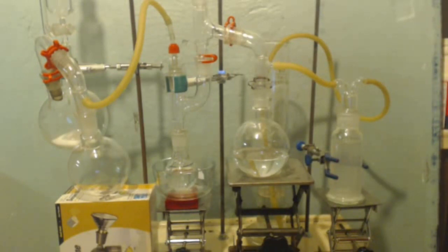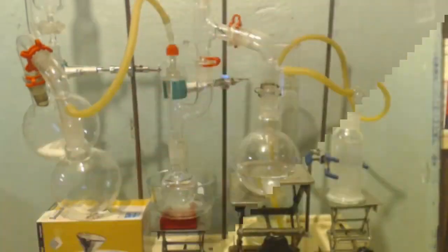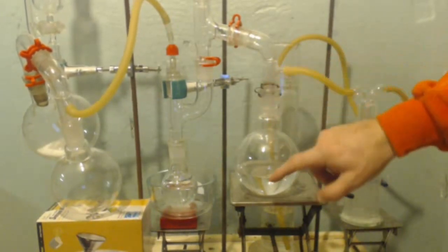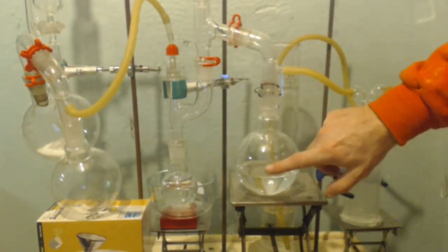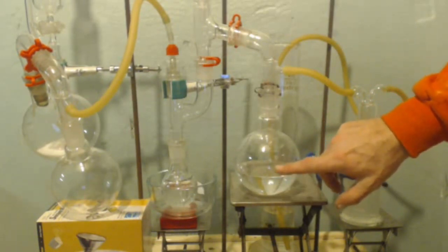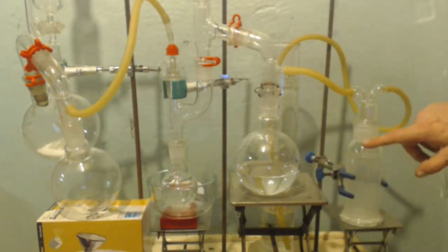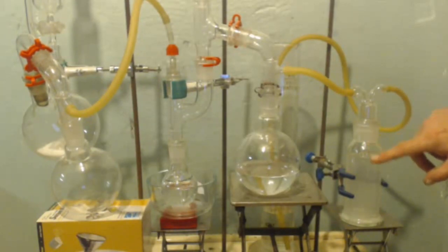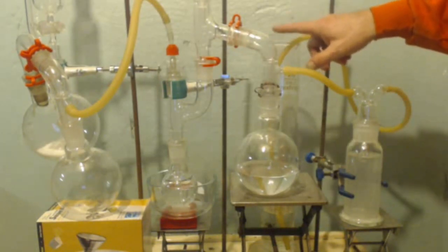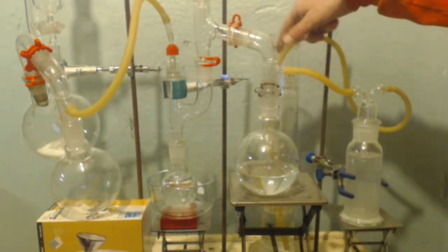So I'm going to start the reaction now. To think about it, even though there's no tube leading into this water, it will absorb some hydrogen chloride and become hydrochloric acid. Dilute, but still. This will create sodium chloride in water. Oh well, maybe I shouldn't have put so much. It's going to make water too. Anyways, then it will go back here and make some more hydrochloric acid because there's just water in there.